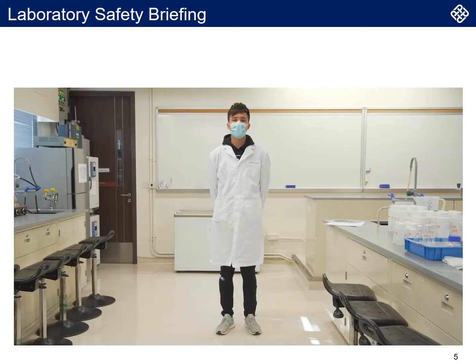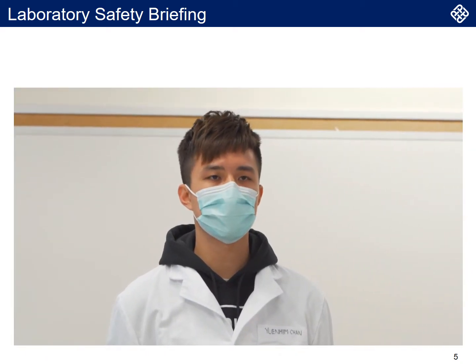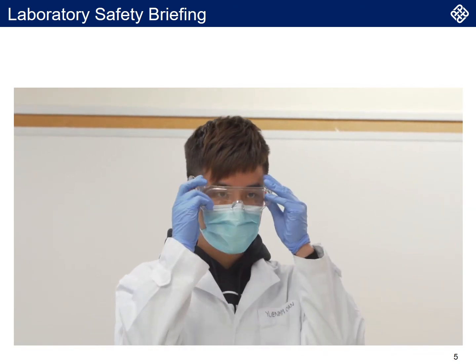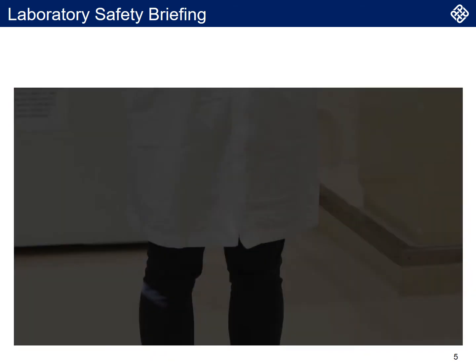Welcome to the Water and Waste Laboratories. I am Jonathan. Laboratory safety is very important in our laboratories, and I would like to remind you to take the following safety precautions. Firstly, please wear a laboratory coat to protect your skin and personal clothing. Secondly, please wear safety goggles and gloves while handling chemicals.